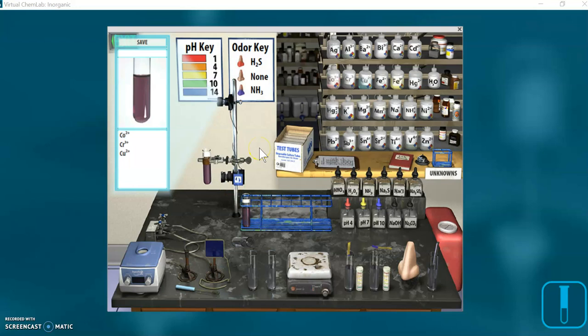If you have a table of solubility rules with you, this lab will make a lot more sense. You can see on the table what you might want to add to your test tube to help you identify and separate the ions in the solution.